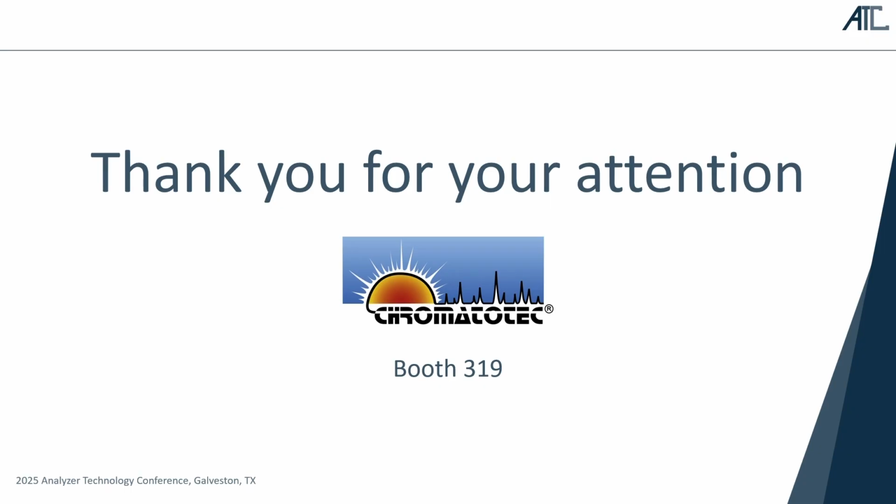Excellent paper. Just a quick question. What's the analysis time? I was trying to read the cycle time at the bottom, but my eyesight wasn't good enough. On this system, the cycle time was 1 hour, so every 1 hour we get a result.